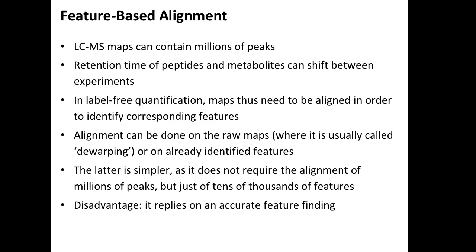So if you see massive issues, if the alignment doesn't work, then you should also do a quality control on your data and potentially rerun some of these samples. Just as a disclaimer, of course we try to correct for these issues, but there are limits to what we can do.